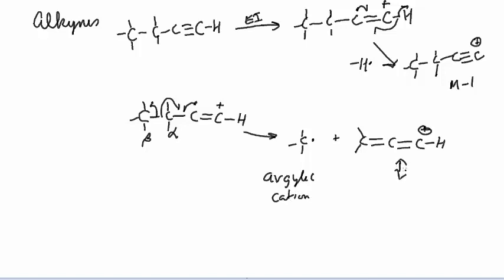This has a resonance form. Let me draw that in, and we're just going to shift the electron pair here. This is not so much a chemical thing happening. It's drawing the resonance structure. And then, of course, you shift pi electrons. We're going to shift this shared pi pair one bond position over, and I'll come up with this other resonance form.